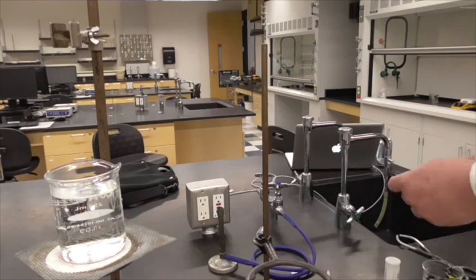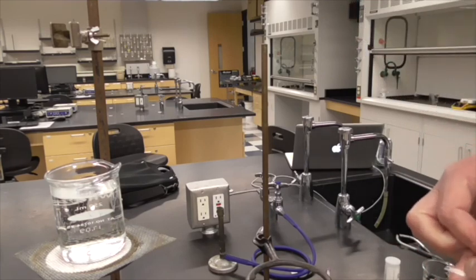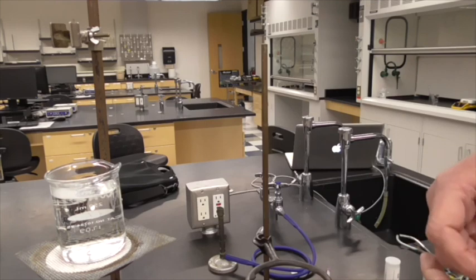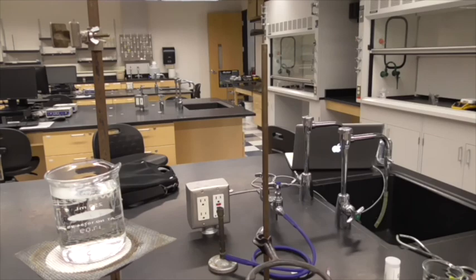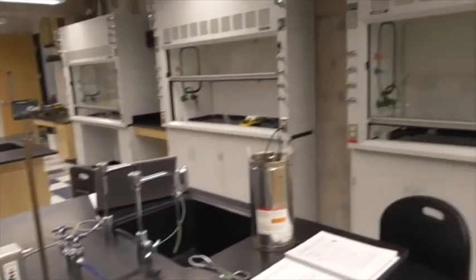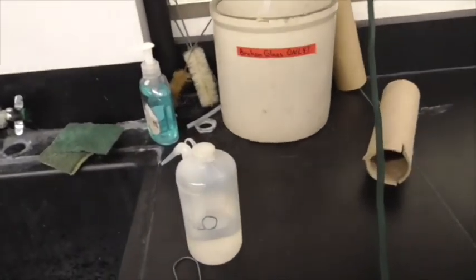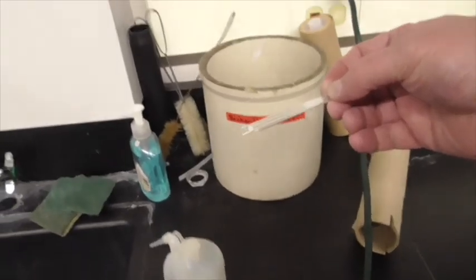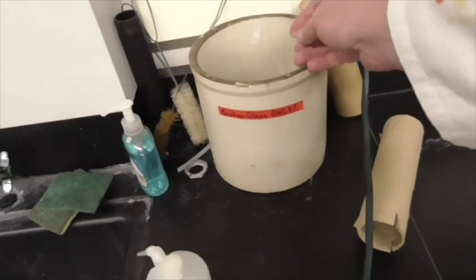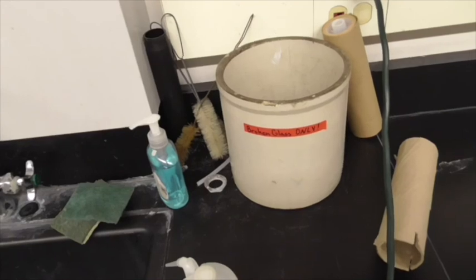So what we need to do now is the capillary tubes that we use. All these guys. Okay, we're going to come over by our sink here, and we've got this brown container. You can see that it's broken glass only, and that's where these go. So I'm going to just put them all in there and not drop them all over the place.